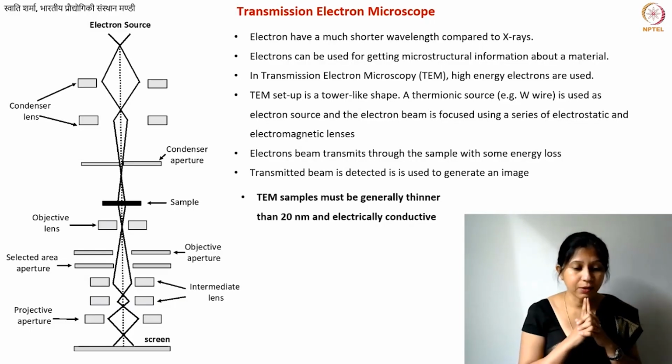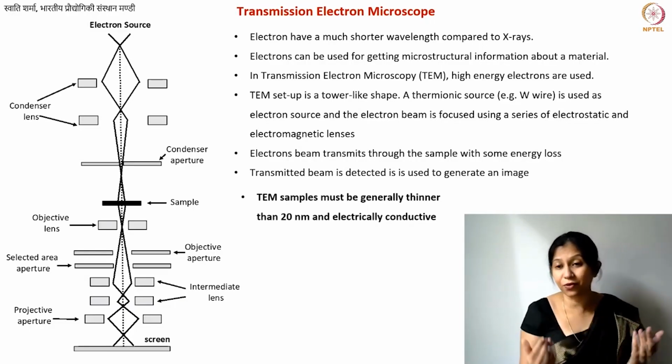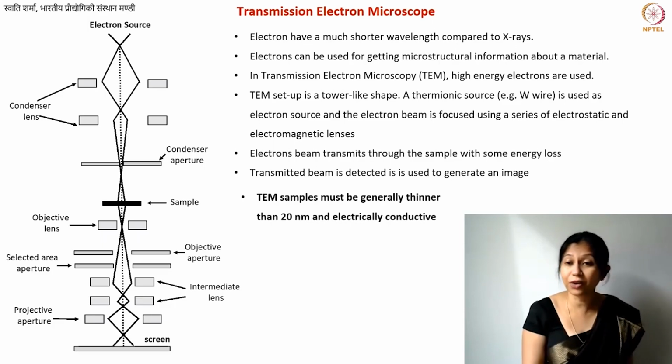In that case, well, you can measure the diameter of your fibers, but that you could even do using scanning electron microscopy, right? 200 nanometer, in fact, there are even optical microscopes that can give you that information. So for that purpose, in principle, there is no need to use transmission electron microscopy, especially high resolution. As the resolution increases, we are basically using higher and higher energy electrons. So that information can also be achieved by other techniques.